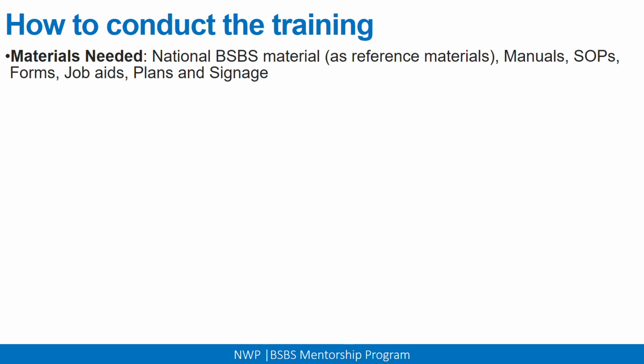While structuring this training, you make sure that you look at the manual clause by clause or section by section. That way you get feedback from the participants or the laboratory staff on each particular part of the manual. And after you're done, of course, you need to make sure that people sign that they were oriented or trained on the use of the manual and on the basic information in that particular manual.